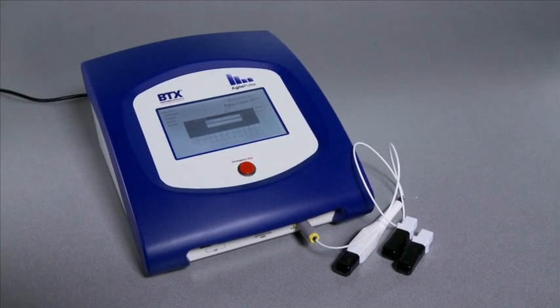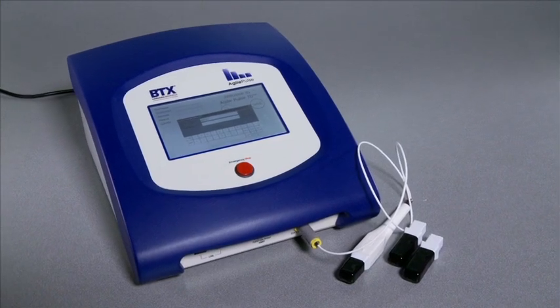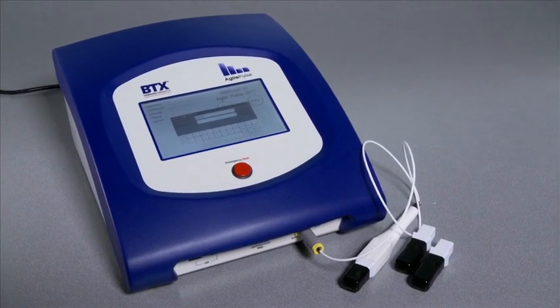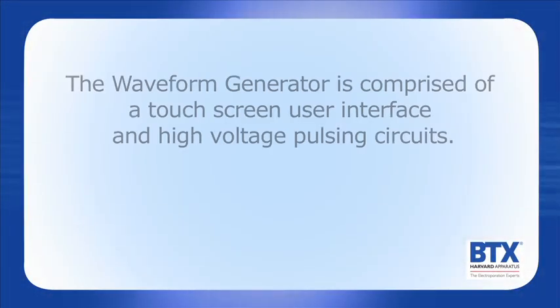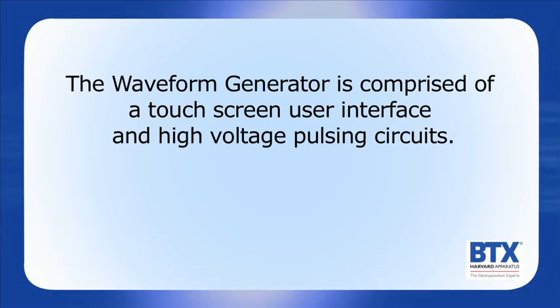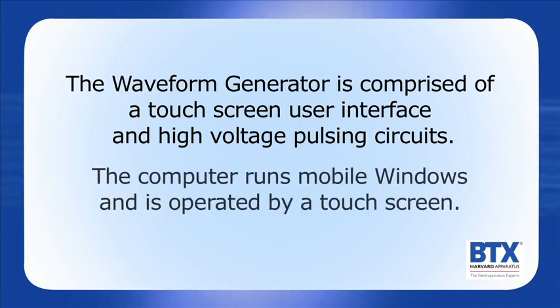Welcome to the AgilePulse in vivo system training video. The waveform generator is comprised of a touch screen user interface and high voltage pulsing circuits. The computer runs mobile Windows and is operated by a touch screen.